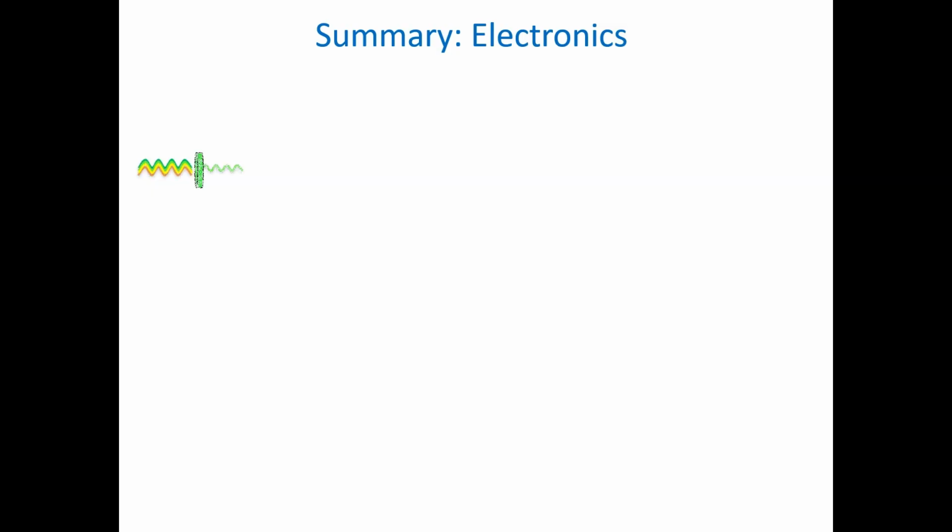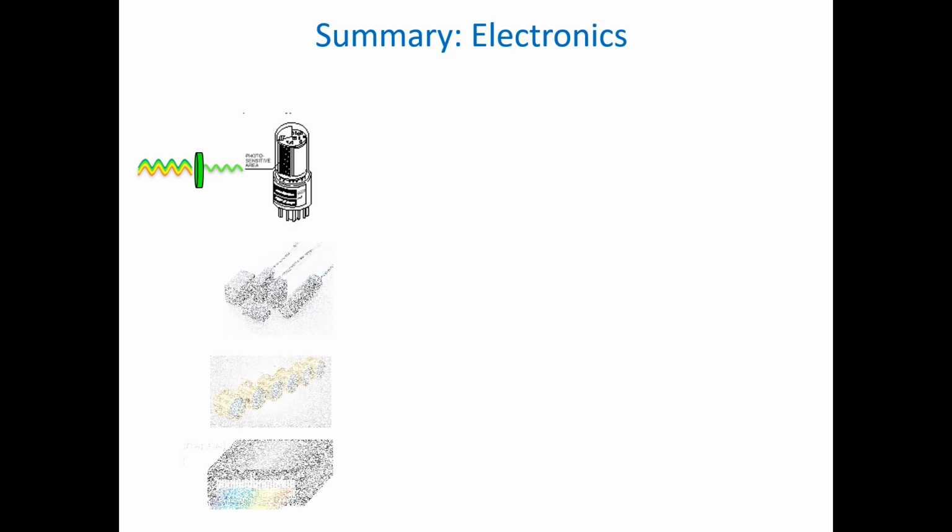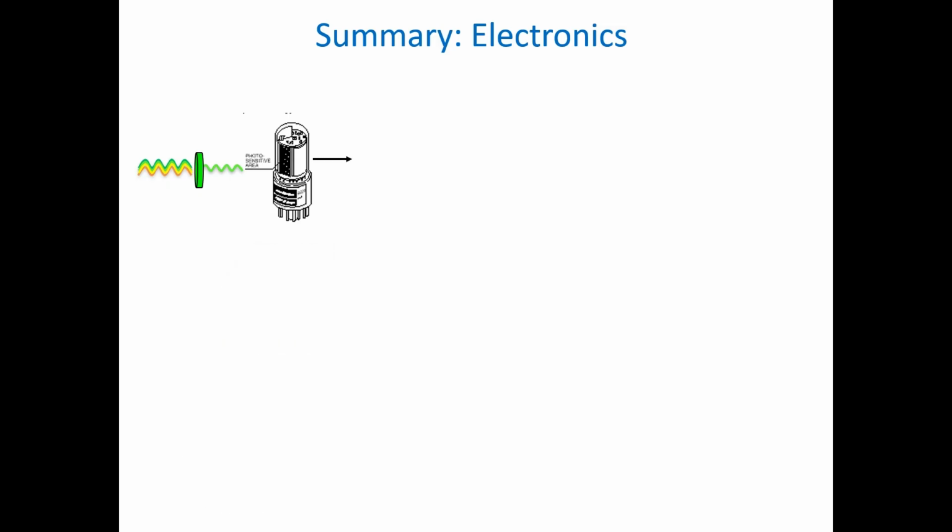The fluorescent light emitted by the cell has passed through the optical collection system, and the photons of light arrive at the detector. We've looked at different kinds of light detectors, from simple photodiodes to PMTs, APDs, and silicon photomultipliers. The light detector emits a current that is amplified, producing a voltage pulse proportional to the light that reached the detector and to the voltage applied to the detector multiplication system.